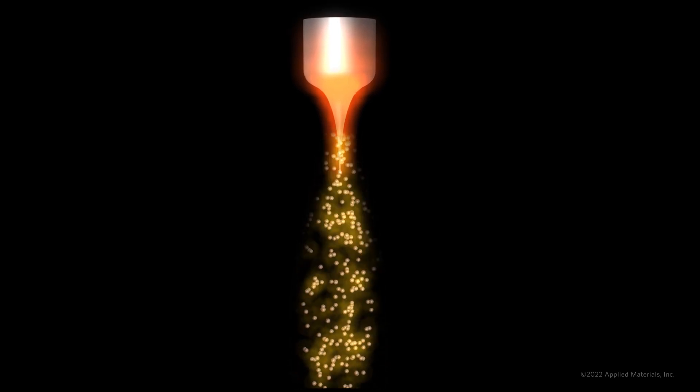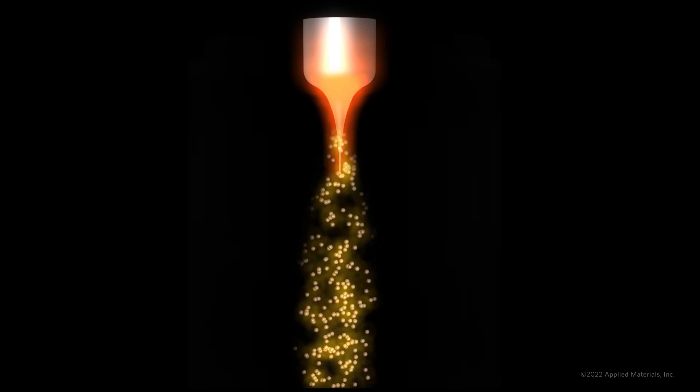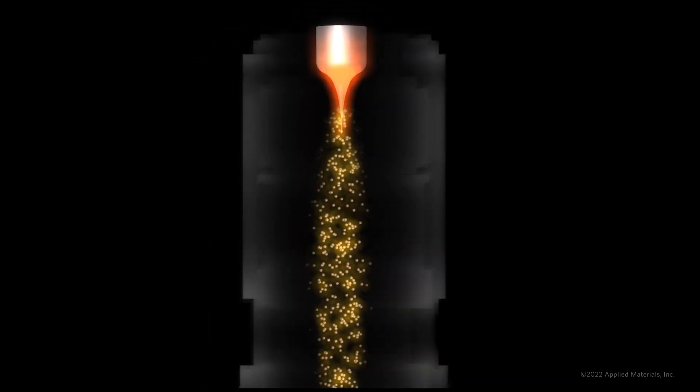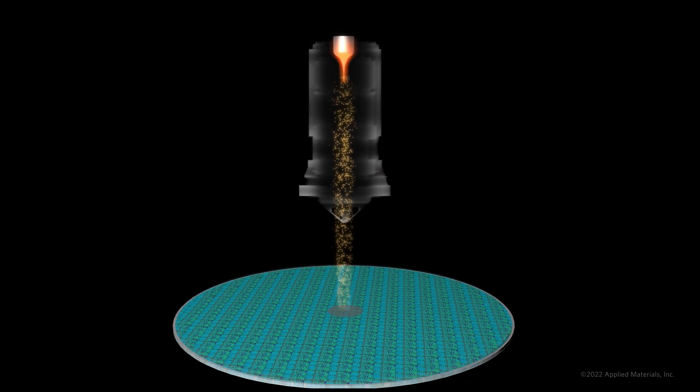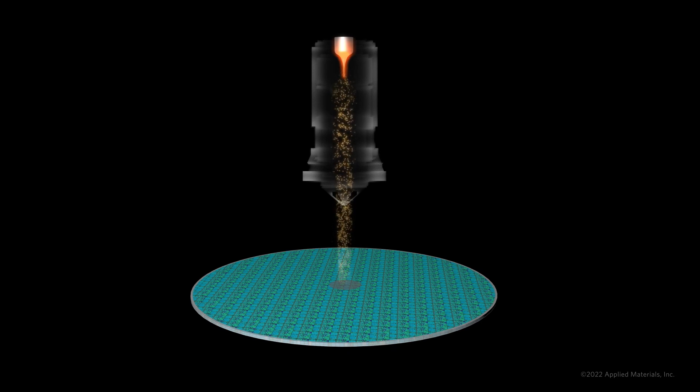As electrons are emitted from the source tip, a cloud of electrons is developed and shaped by electromagnetic fields within the column to form the e-beam. Once electrons exit the column and reach the sample, detectors capture any secondary or backscattered electrons to produce the image.